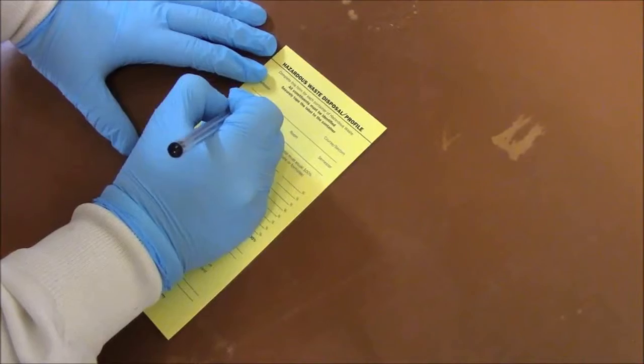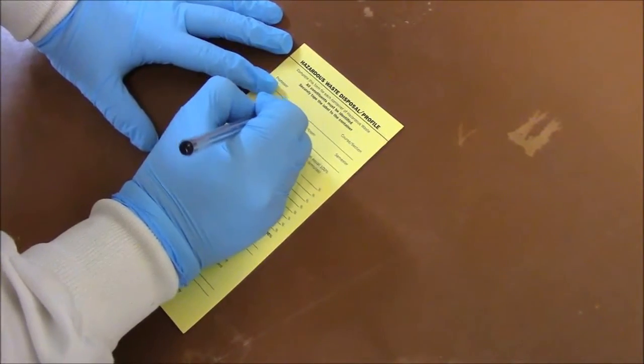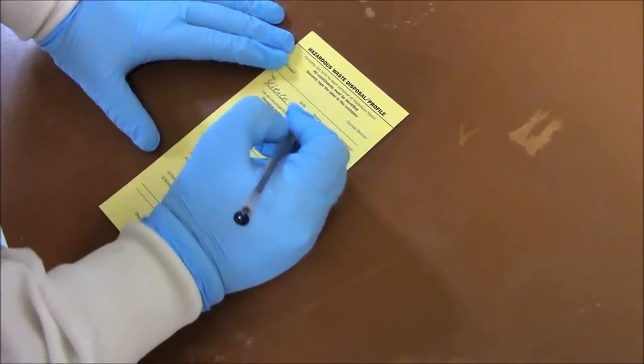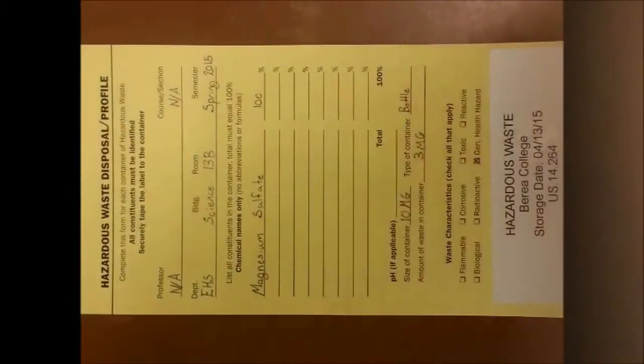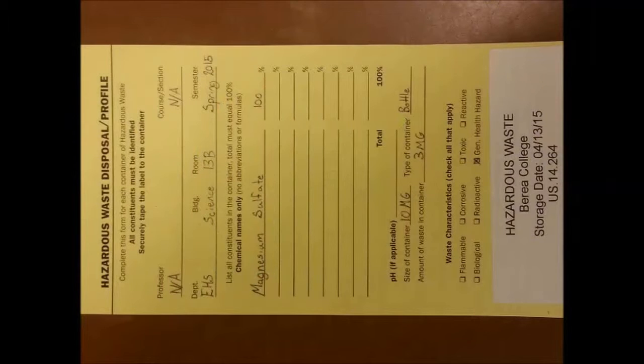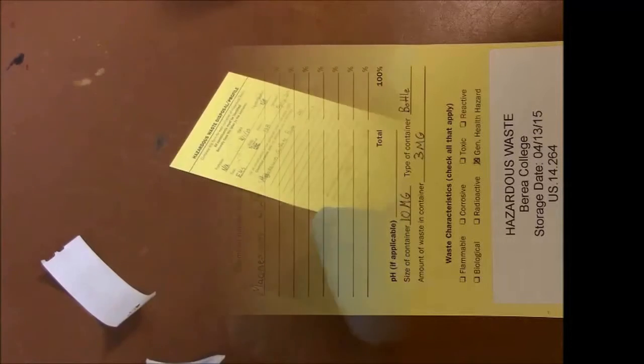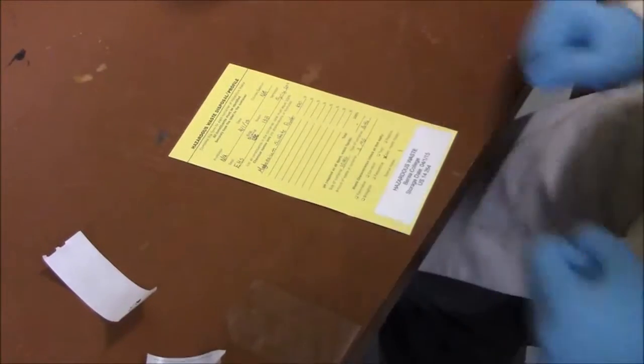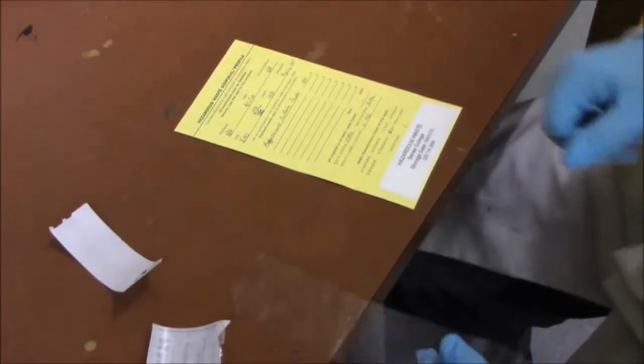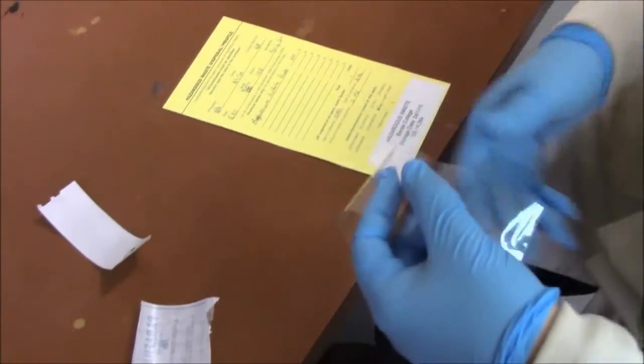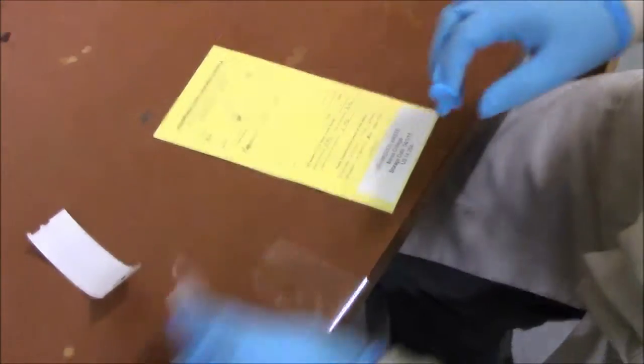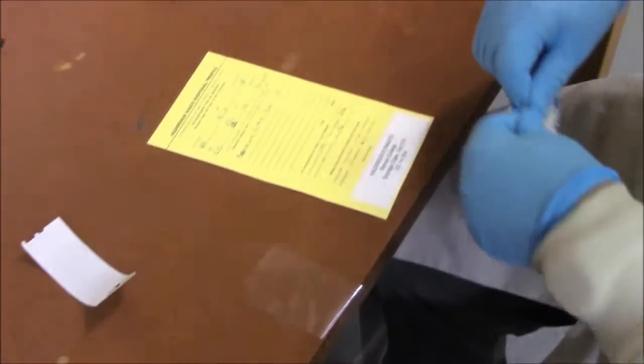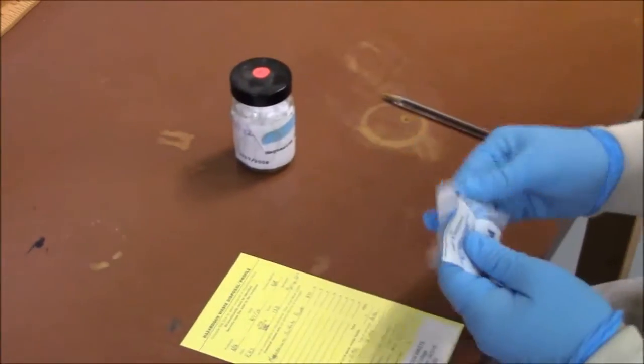Next you're going to fill out the yellow waste disposal card. On this card, you're going to put the department, the chemical you're wasting, its concentrations, the size of the container, and the amount of waste in the container, as well as the primary hazard. After you get that filled out, you're going to put the waste ID sticker on the waste card.